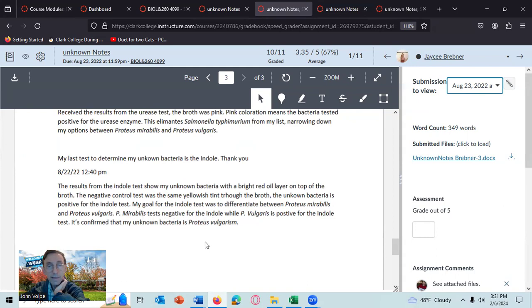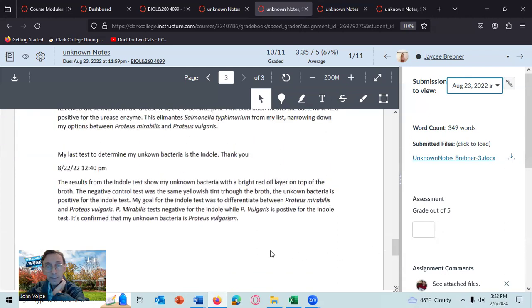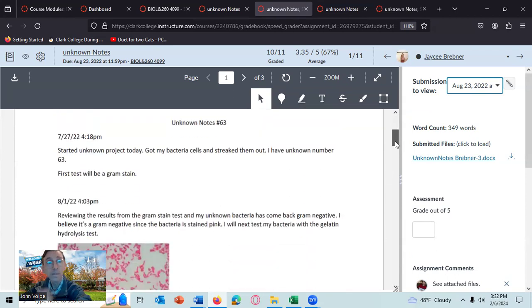And so there he's got his unknown stated. And that's the end of the test. He could do one confirmation test if he wanted, and he did not. And so that was his unknown notes. So all of your results, when I send it to you, should be put on your unknown notes pages. You should put on your conclusion.